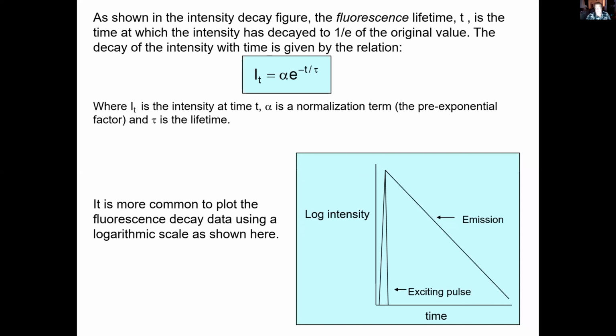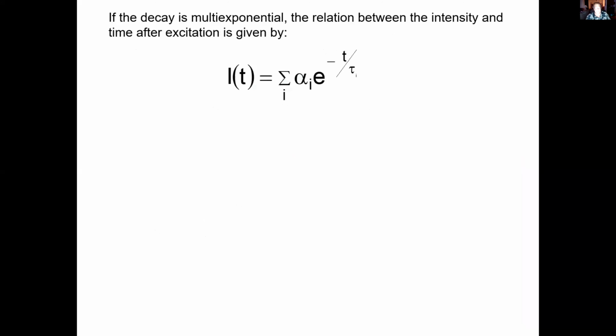And in fact, when I was a student, I even did a little bit of time domain data, I'm embarrassed to say. No, that's fine if you do that. And one of the reasons we would put these on graph paper was to get a better idea if it really was a single exponential. Now with computers, you don't need to do that.